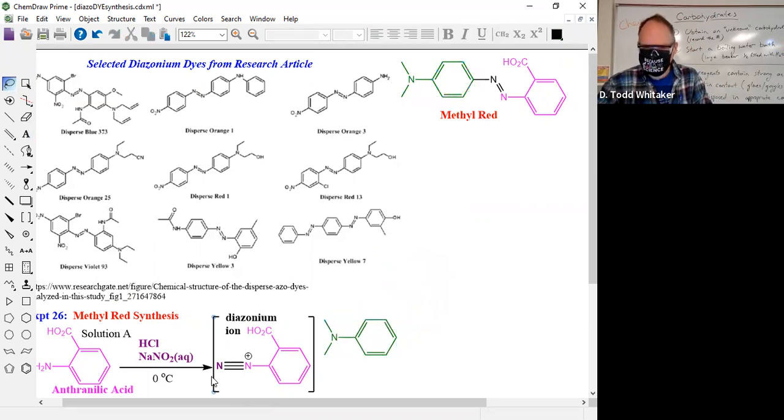Notice I got it from up there. And I got it from my target molecule up there at the top of the screen, methyl red. That's where we're going. And I think that arrow needs fixing, because that's going to be the end of our story, right?